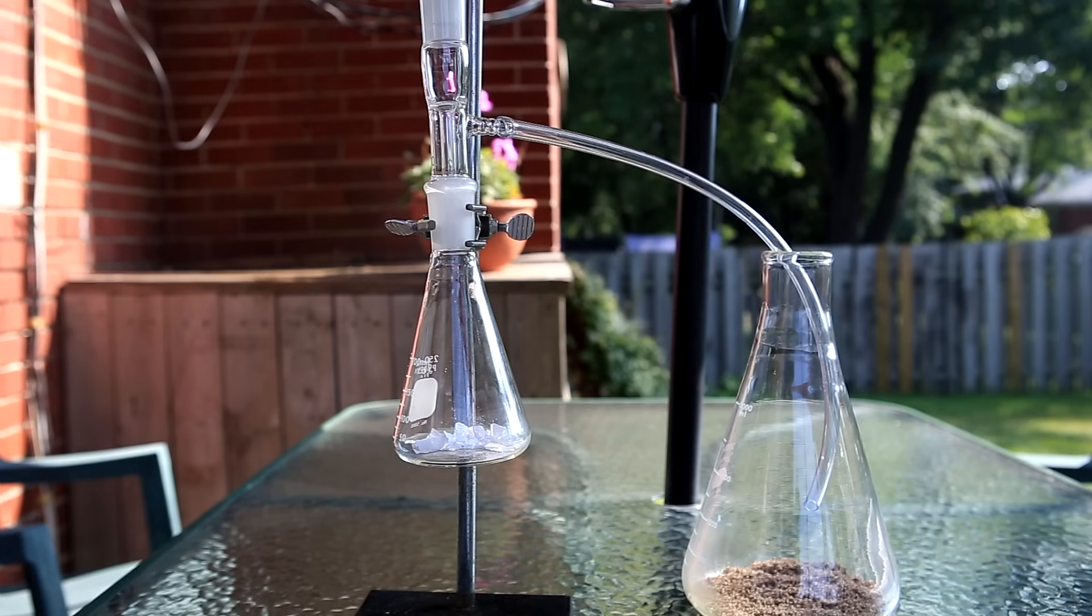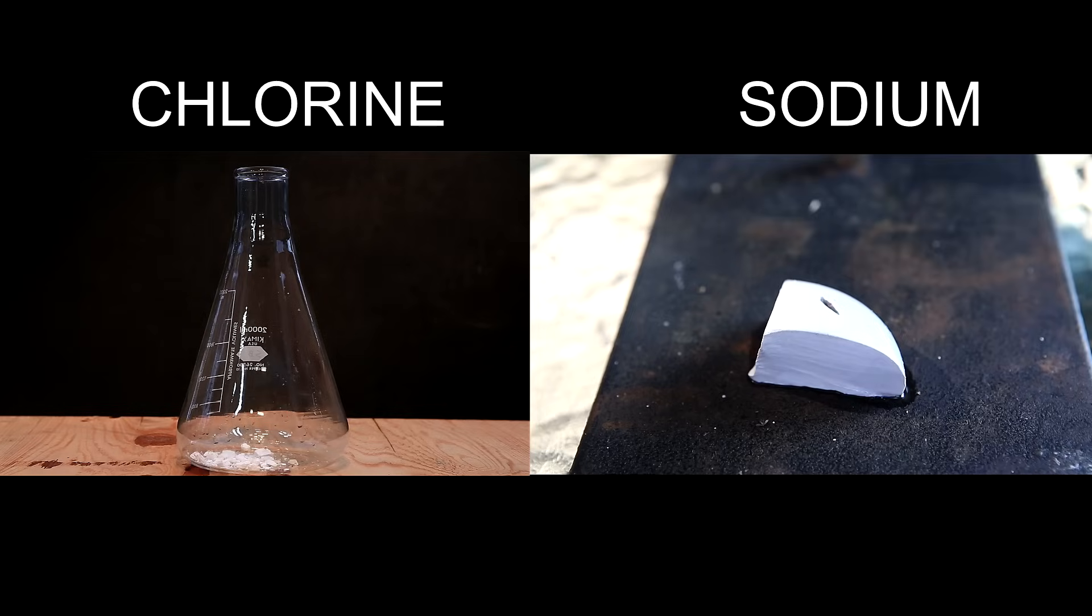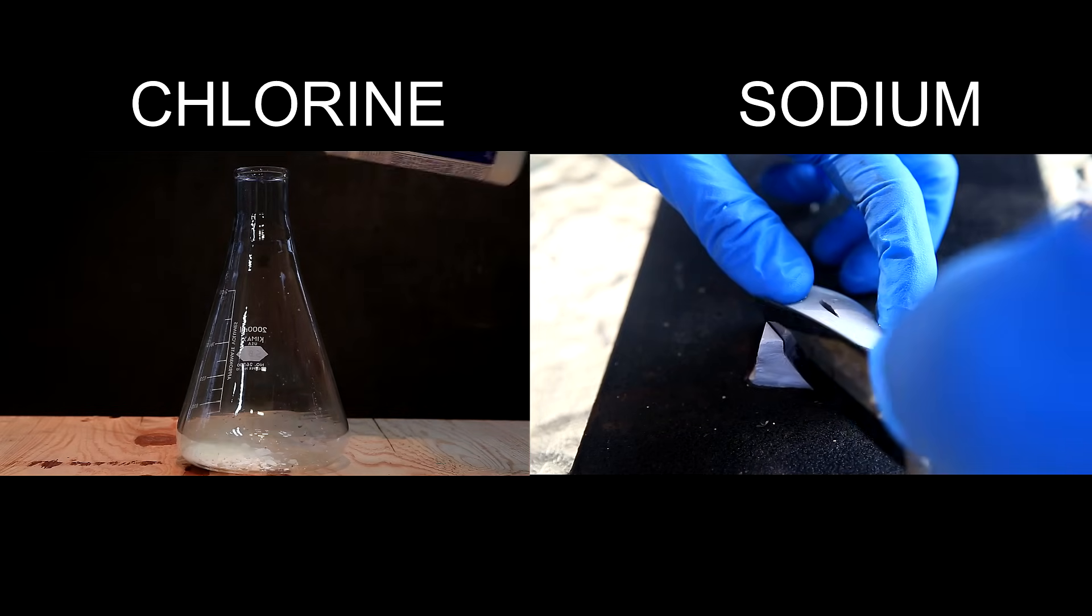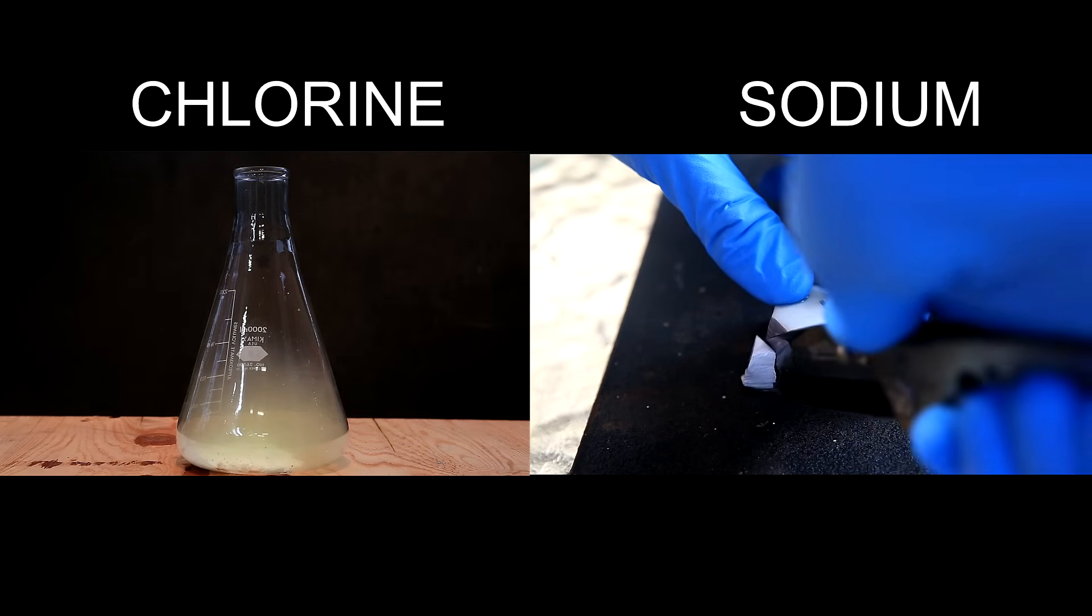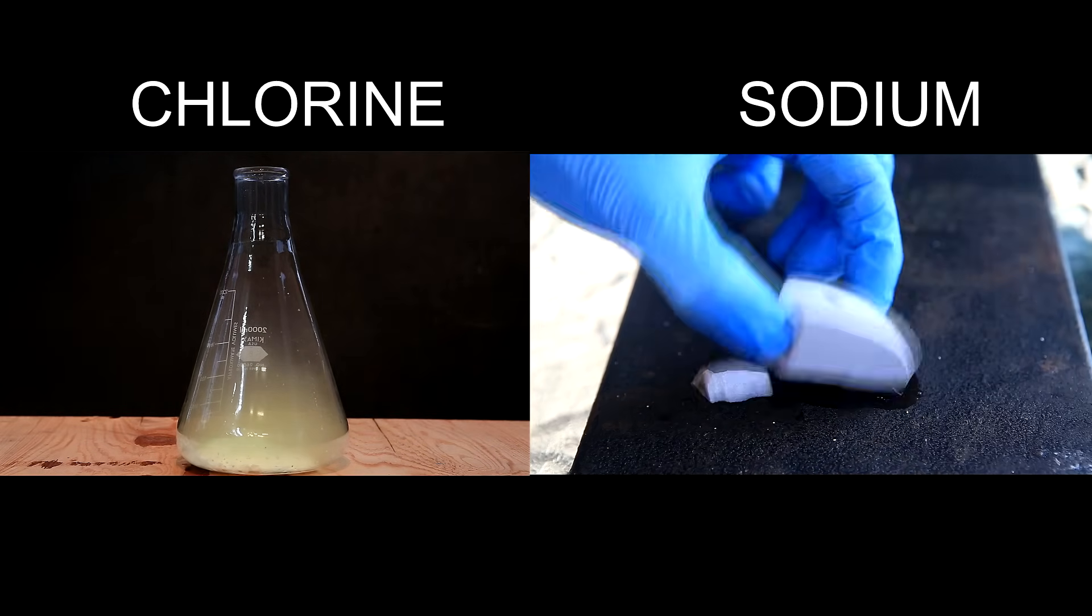So this is my little setup to make some table salt, also known as sodium chloride. Just from the name sodium chloride, you can pretty easily see that it has two major components, sodium and chlorine.